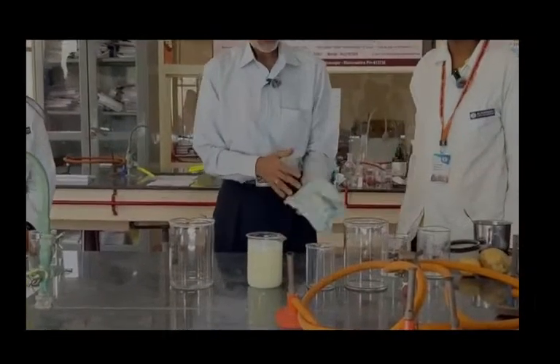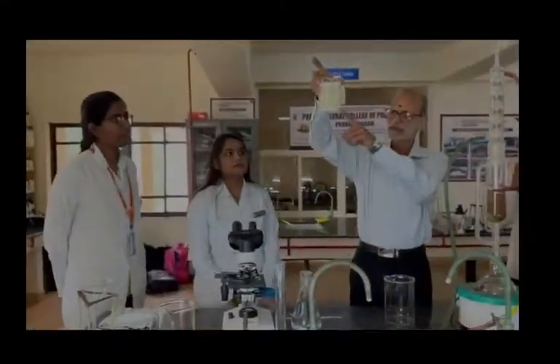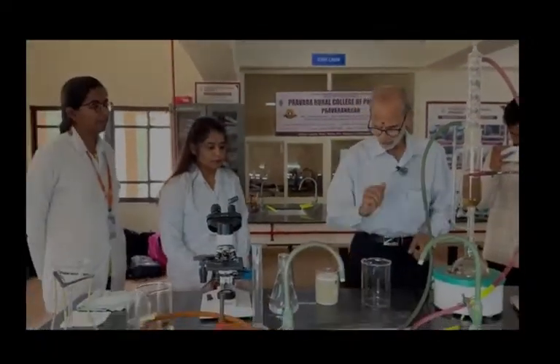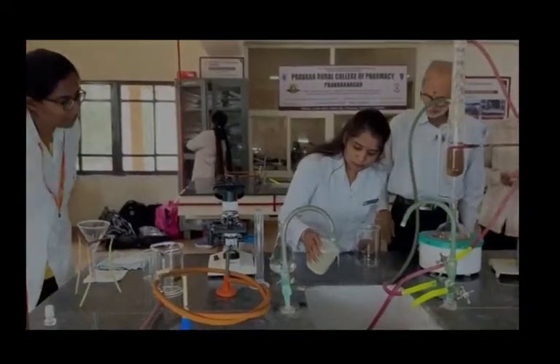Fine? Okay. At the base you can see the layer of the potato starch which has been settled. So Ankita, what you do? Decant the supernatant. Decant it completely, don't bother. Decant it. Quick. Fine? Okay.